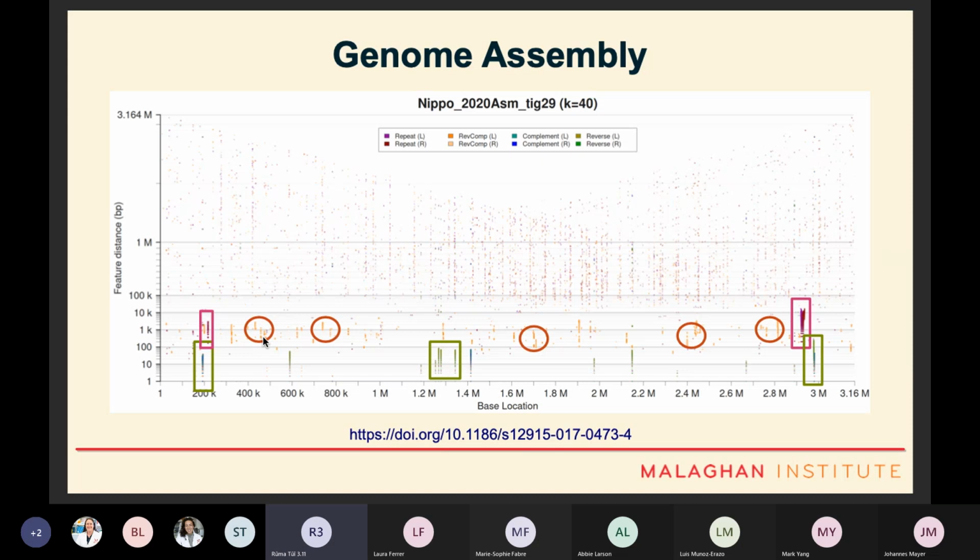For those who aren't familiar with genome assembly, you typically first identify ideal fixed-length subsequences or seeds for matching bits of different pieces of sequenced DNA. The ideal seeds are ones that have high complexity and are easy to identify in other sequences. There's a bit of an art to getting a good assembly. You need a good eye for the repetitive structures that can cause problems, including the things that look locally unique, but are duplicated in completely different regions of the genome.